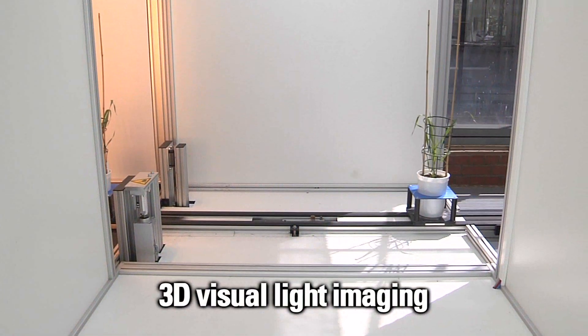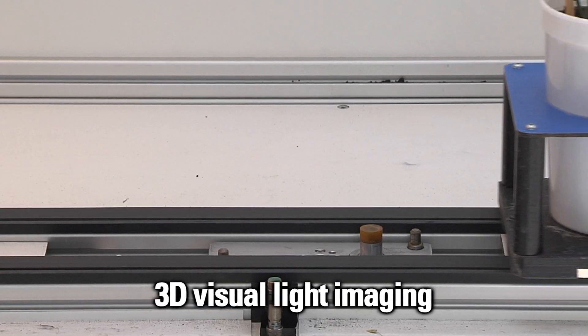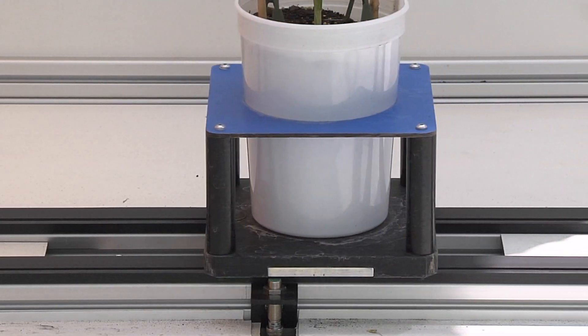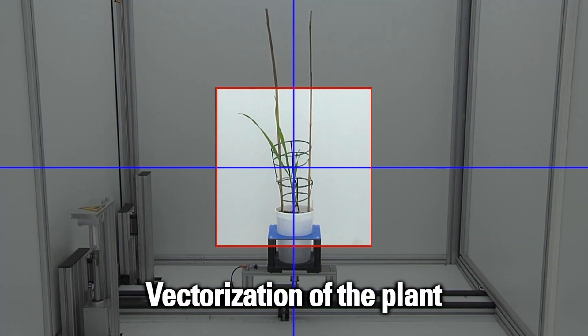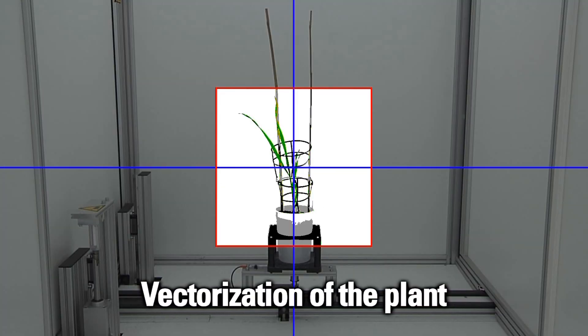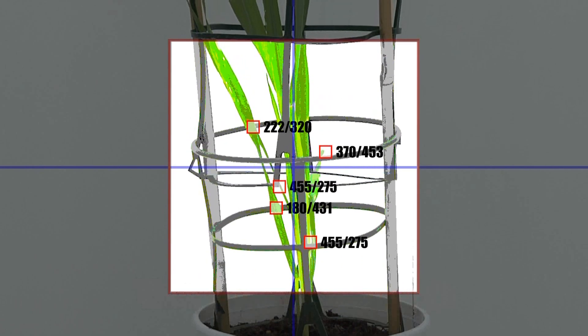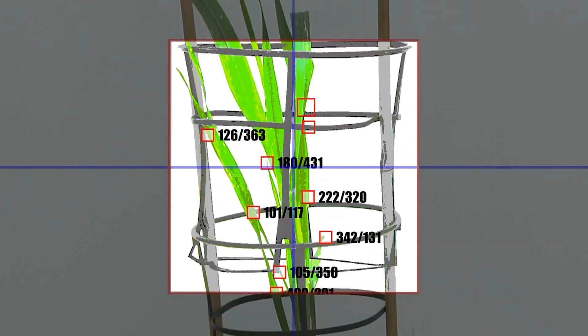Based on multiple wavelength imaging, plants are imaged under highly defined conditions in specific chambers. Plant specific imaging protocols lift the plants and define camera magnification in order to achieve optimized imaging of all growth stages.